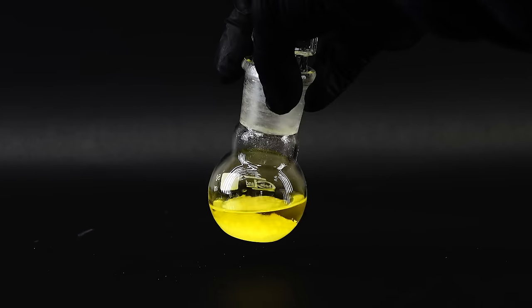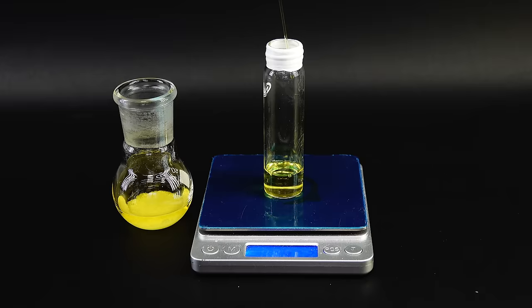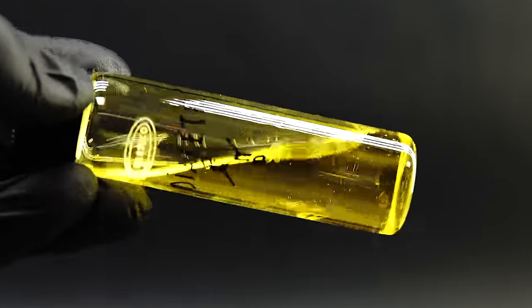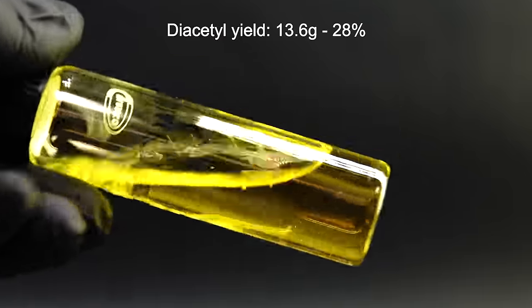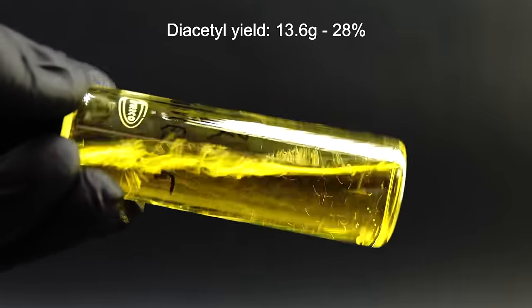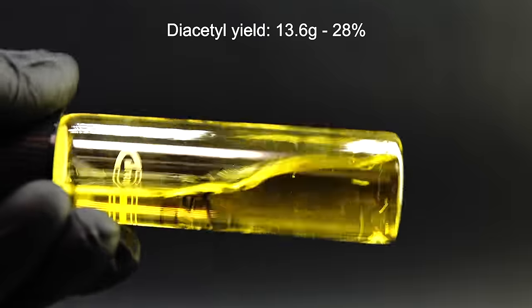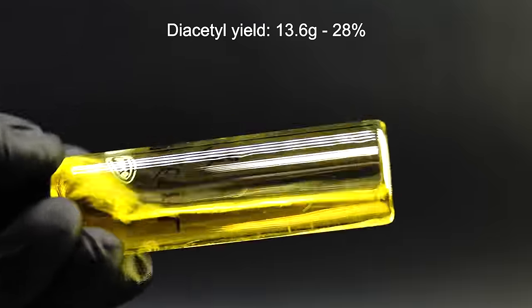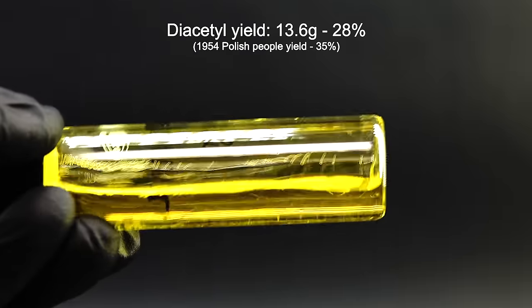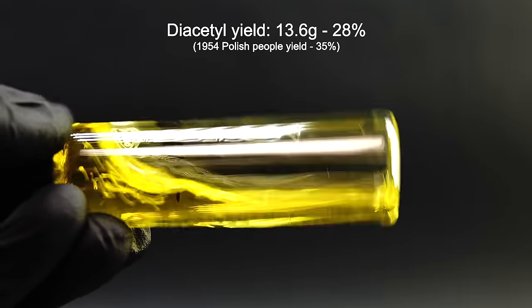After all this it should be bone dry, and to store it I transferred it all into a vial. When it comes to the yield I managed to make 13.6 grams of some nice and yellow diacetyl. This corresponds to a total yield of around 28% which is honestly kind of trash, but it's quite similar to what they achieved in the book, so I am pretty happy I managed to successfully reproduce such an ancient procedure.